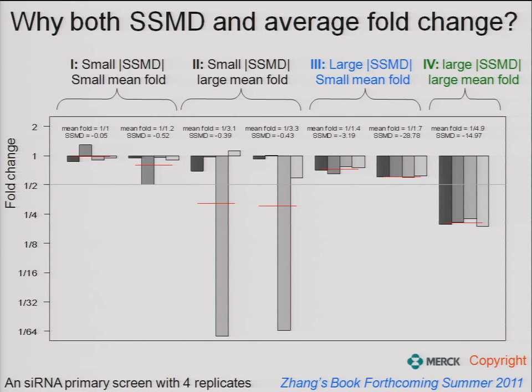SSMD small and but we could go to greater than 2, except this one, the rest can mess up. Just this one has fold change.